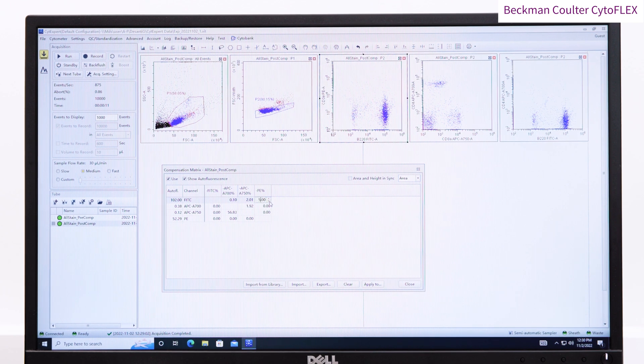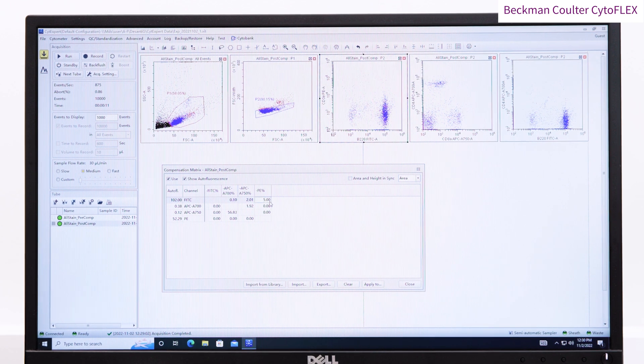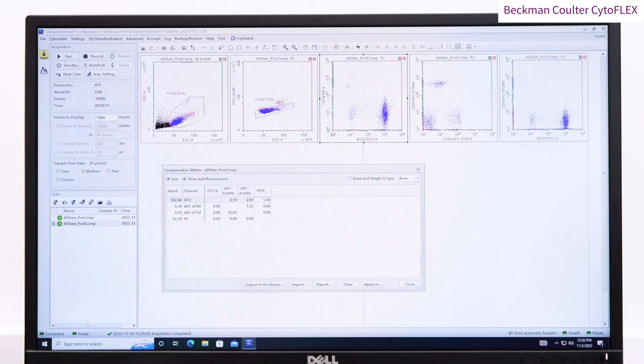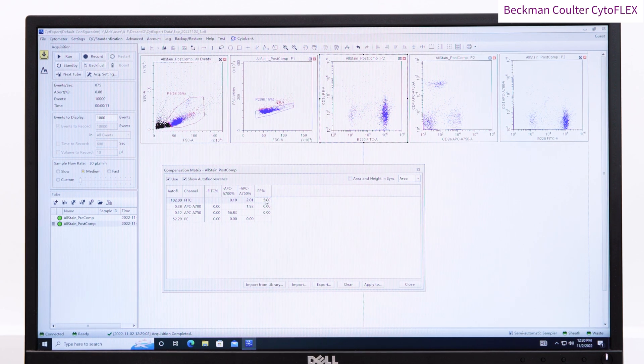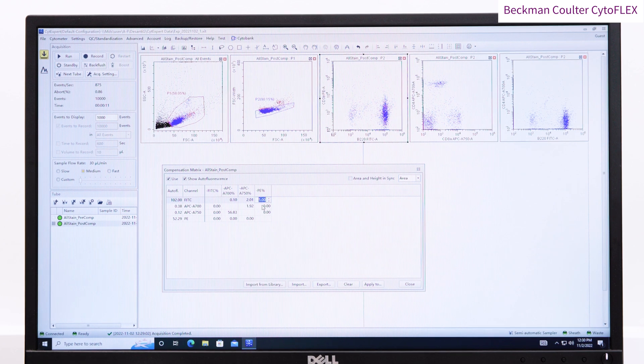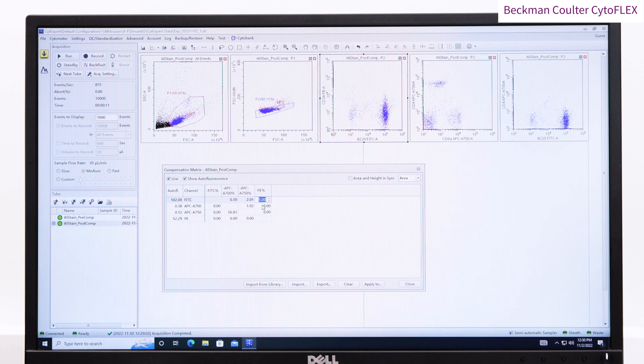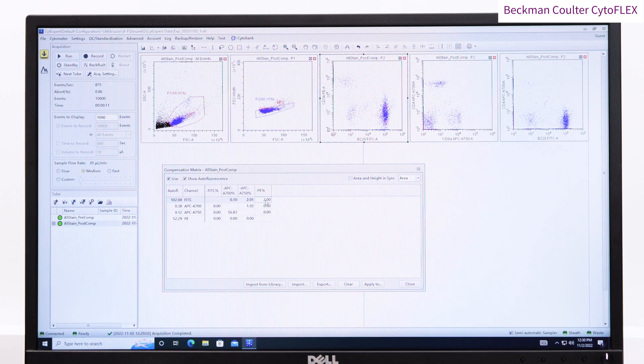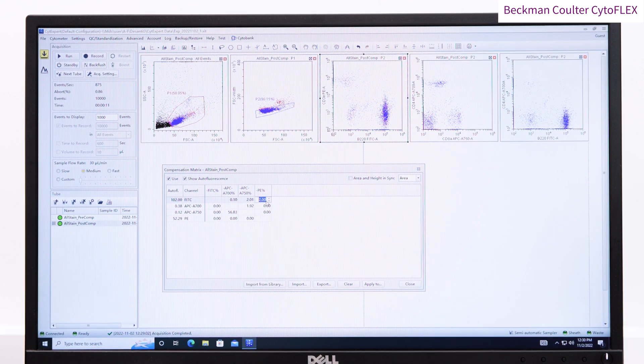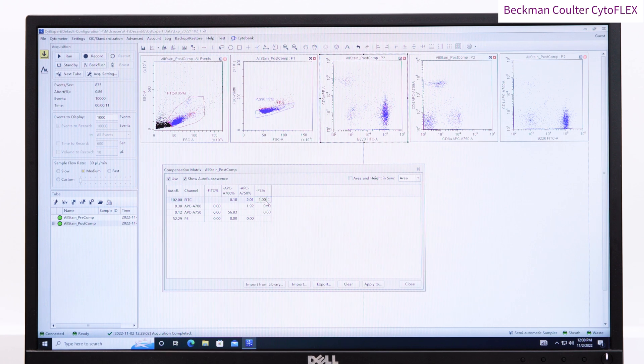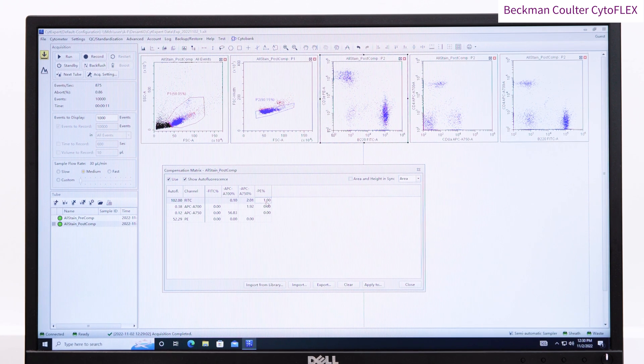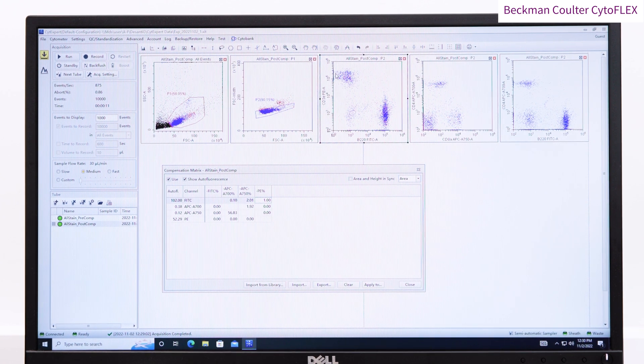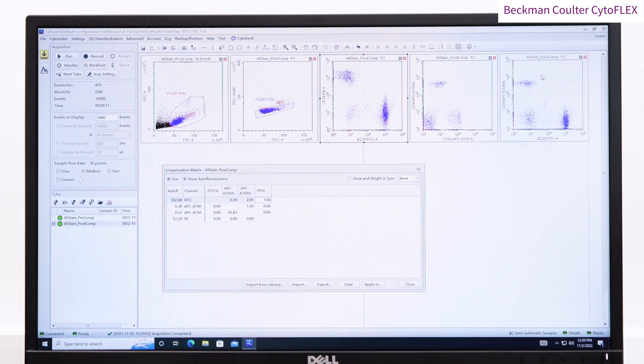Try reducing the percentage down, here all the way to 1%. If you wish to get this as accurate as possible, in this example we would correct it until the FITC signal was equivalent in the PE positive and PE negative populations.